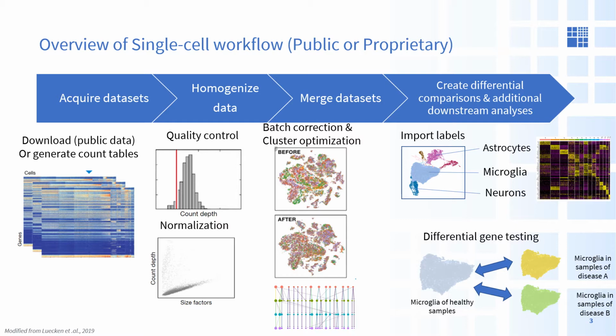Finally, we get into our differential expression and differential comparisons. So we can import cell type labels so that we can make biologically relevant comparisons, and we can also do differential gene testing in treatment versus control or disease versus healthy samples of the same cell types.